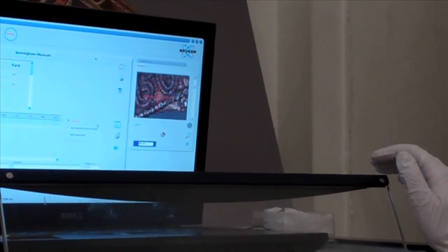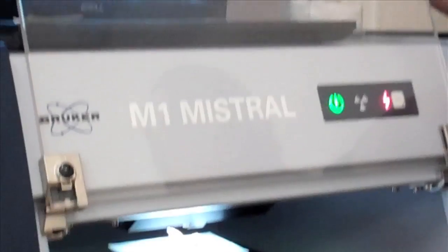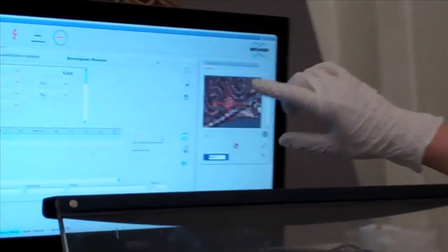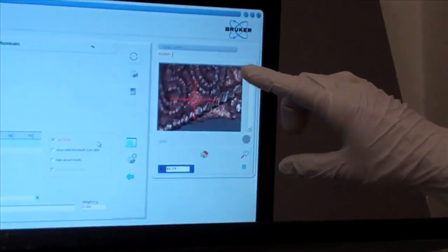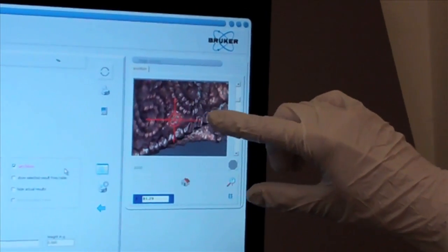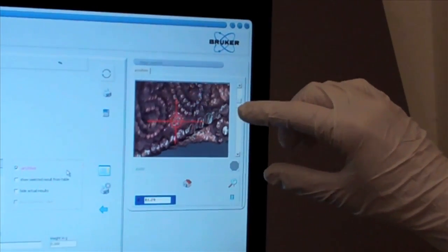So here what I've done is I have placed the object in the machine. And on the screen here you can see the object, the area that we want to measure is in focus, and we have the cross hairs indicating where we're going to be taking our measurement.